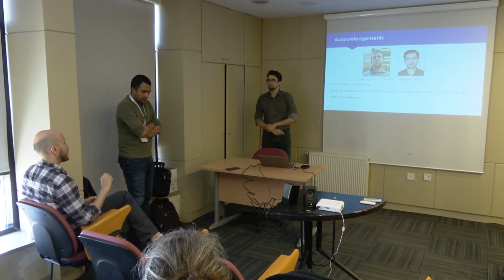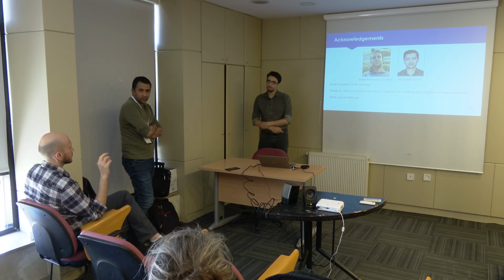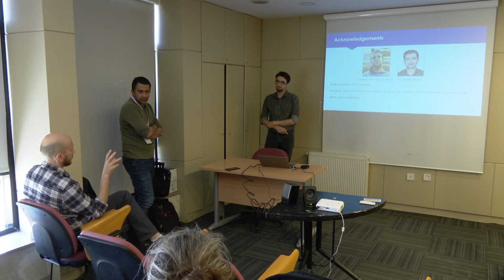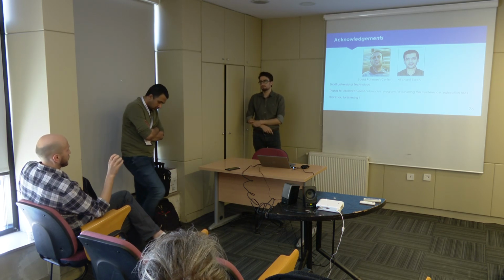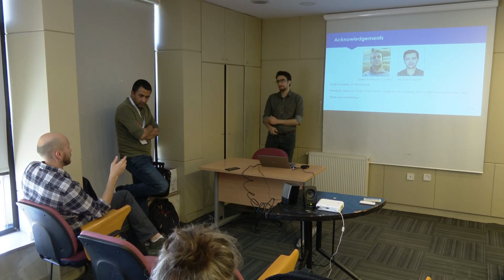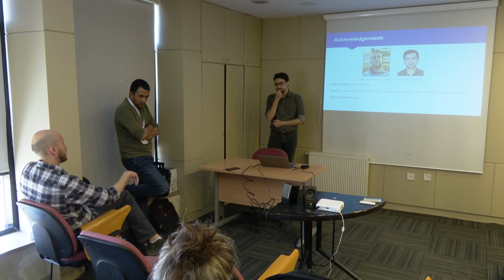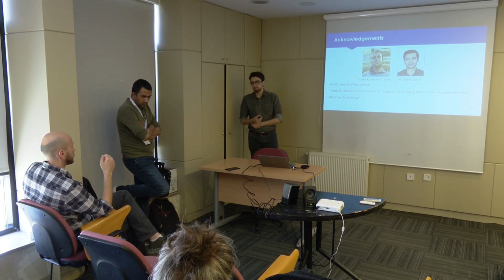Regarding when you learn the weights for the reference genes, can you impose some sort of penalty or sparsity to avoid the overfitting issue that you mentioned, and also maybe learn a smaller subset of genes that can be used as a reference? Because there's the bias, and they have to select which genes go to the weighting, and then you have to weight them and use them in the testing procedure.